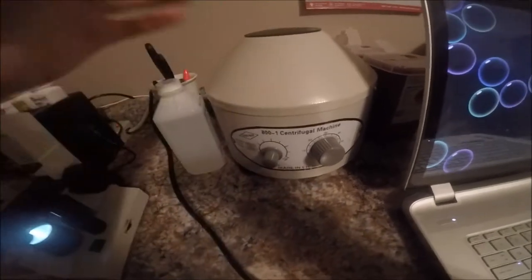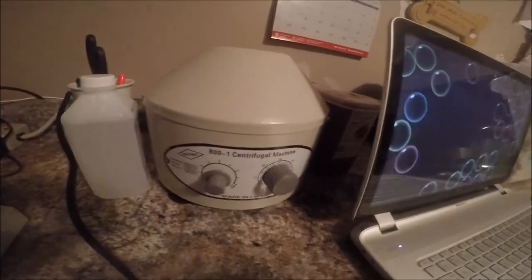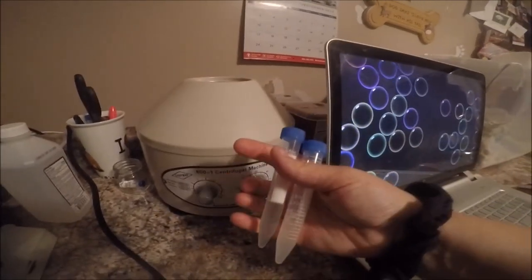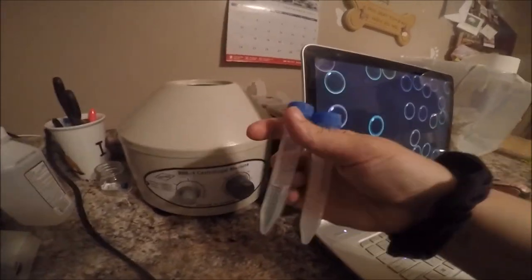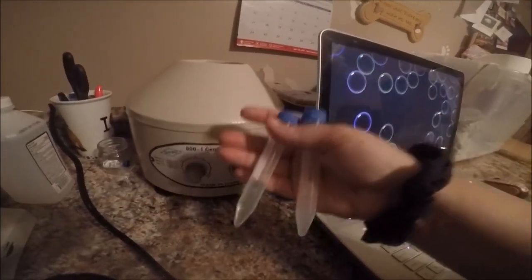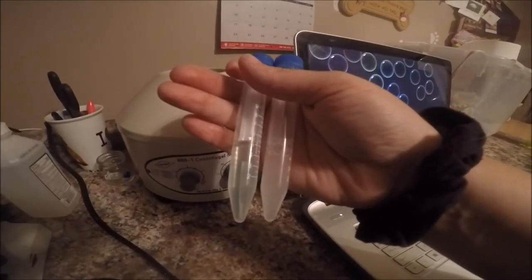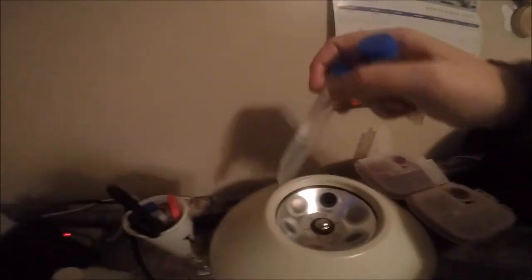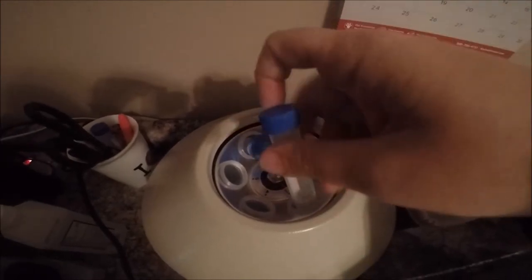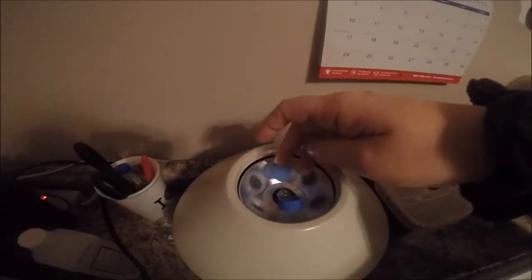One of the first things you're going to want is a centrifuge. You can get them fairly inexpensive — this one is about $120 on Amazon. A centrifuge has to be properly balanced, so you've got to make sure you have another tube with an equal amount of fluid in it. I'm using hand sanitizer as a gel — it's equal in weight. Make sure the levels are even. You're going to put your dummy tube in on one side and the semen on the other side, completely opposite, so that when it spins it's not rocking all over the table.